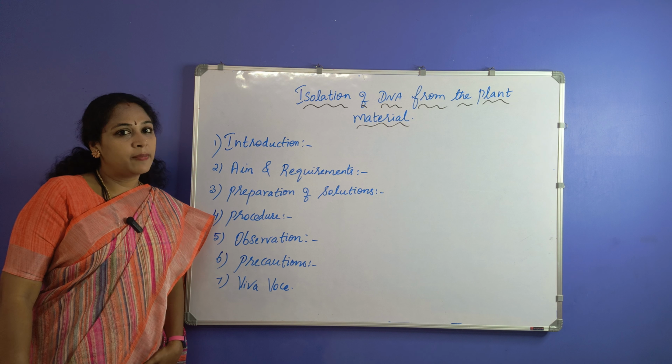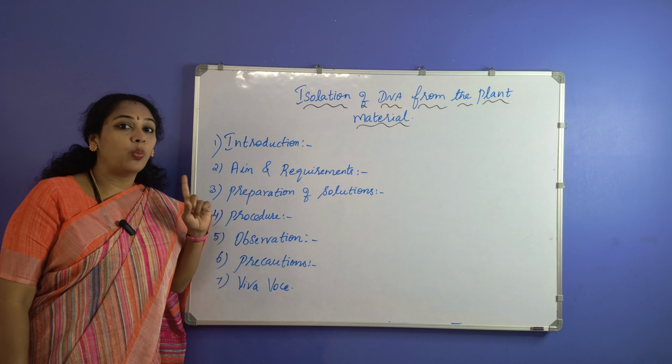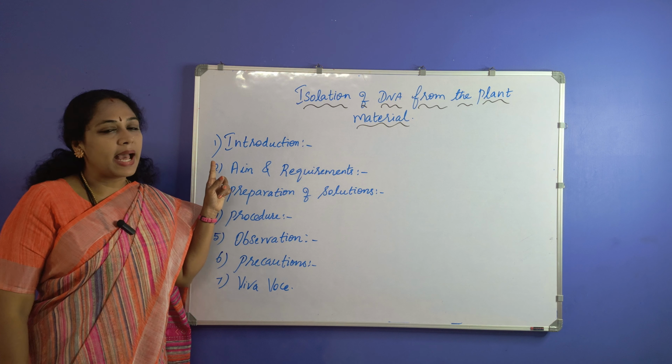Everyone, Gayatri Premkumar here, and today we are going to discuss the first major experiment, the one and only major experiment: isolation of DNA from the plant material.